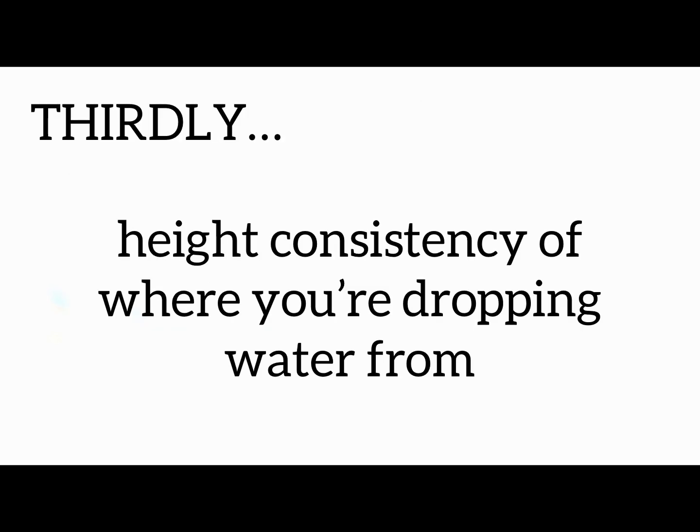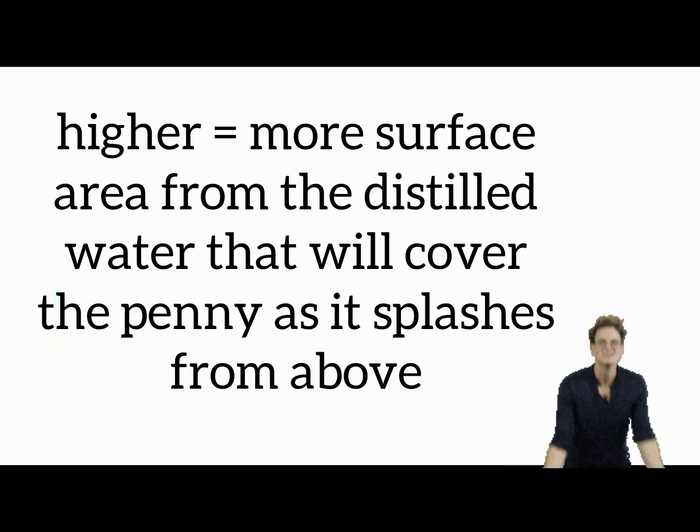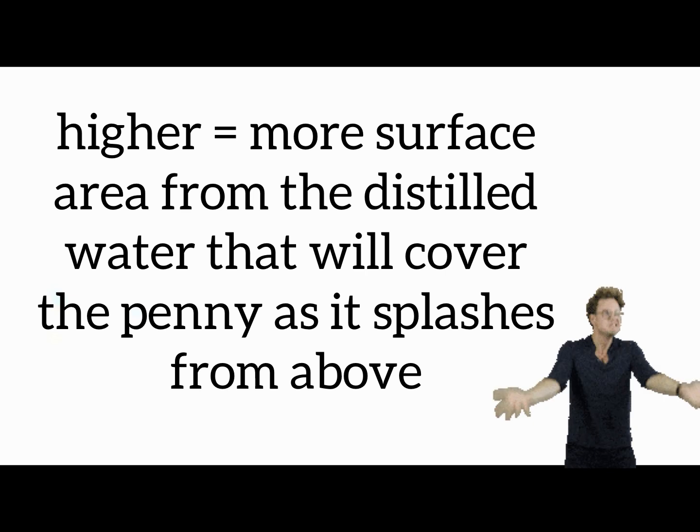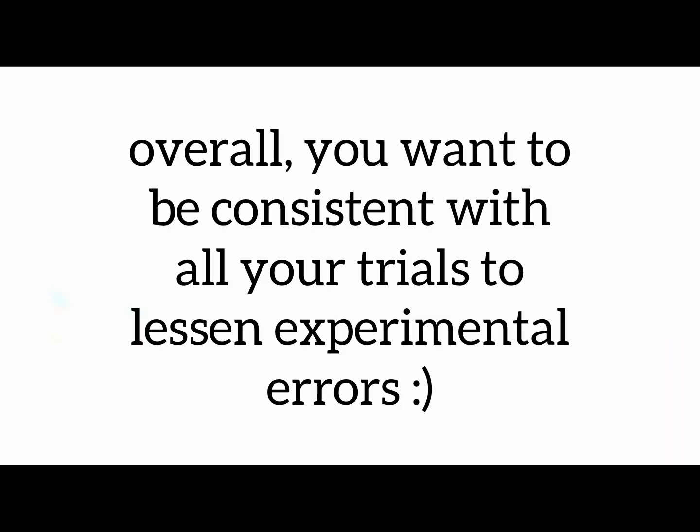Thirdly, the height from which you are pipetting your water also matters, as it will vary depending on how high or low you are from the penny. The higher you go, the more surface area of the penny the distilled water will cover as it splashes from above. Overall, you want to be consistent with all your trials as best as possible to lessen experimental errors.